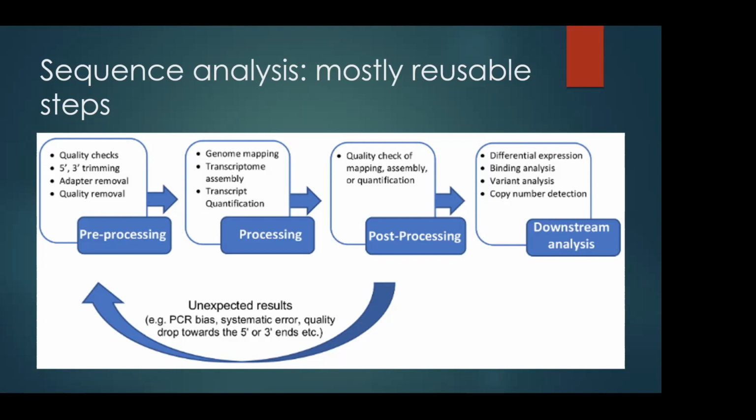But to check if it is complete or not, you need to align them to the whole genome with a splice junction-aware aligner like HISAT or STAR. Or you can do it with TopHat, but we don't use TopHat anymore because it's extremely slow. And the quality of STAR is a little bit better. So you can use STAR or HISAT according to your purpose.